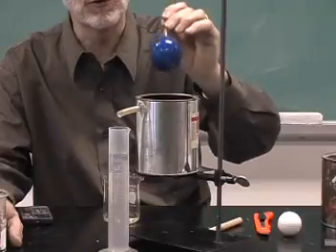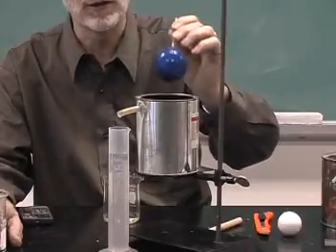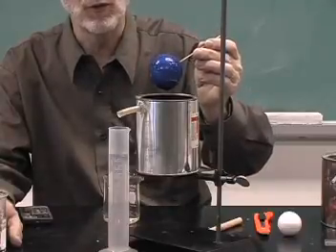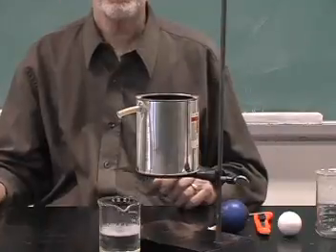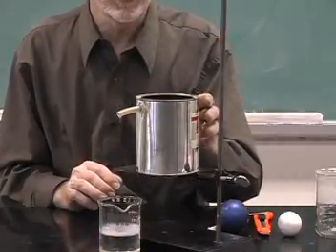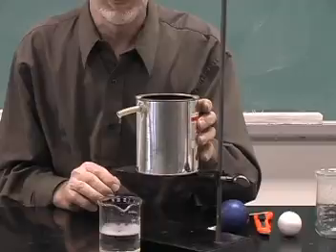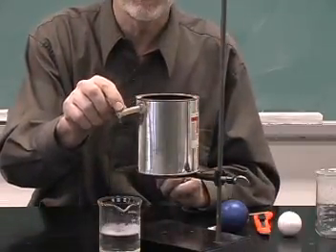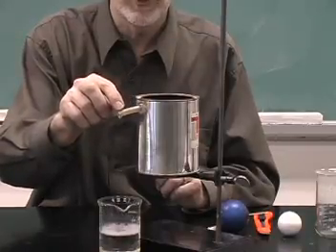It's important to determine the mass of a dry object, because obviously the mass will be increased when the object is wet. One of the problems of using water as a displacement agent is that its surface tension is quite high, and it can actually form large drops in the tube, which will make it difficult for the water to flow out.